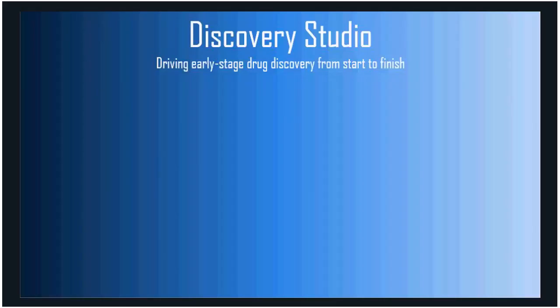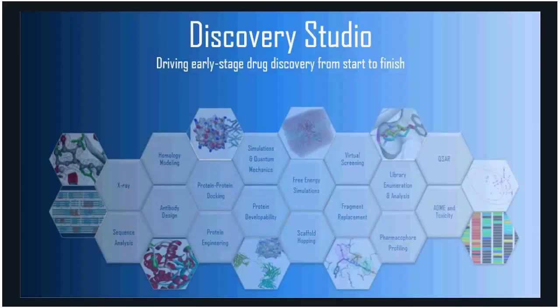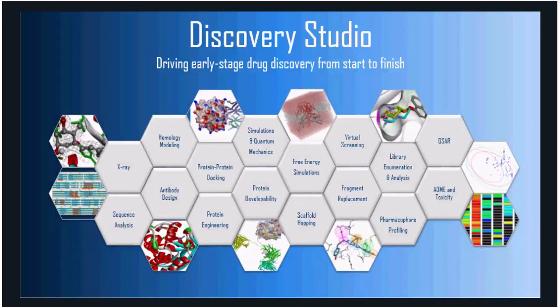So that's an overview of what's new in Discovery Studio. There are a lot more additions that I did not cover today, but the 4 components that I covered: rational biological design, rational small molecule design, MD simulation with explicit membrane support, and our new pharmacophore modeling features are the new major additions within Discovery Studio 2020. And with that, I'll take any questions that you may have.